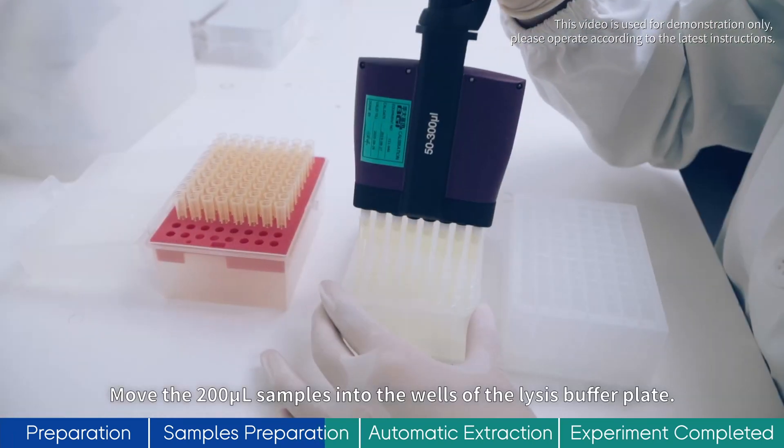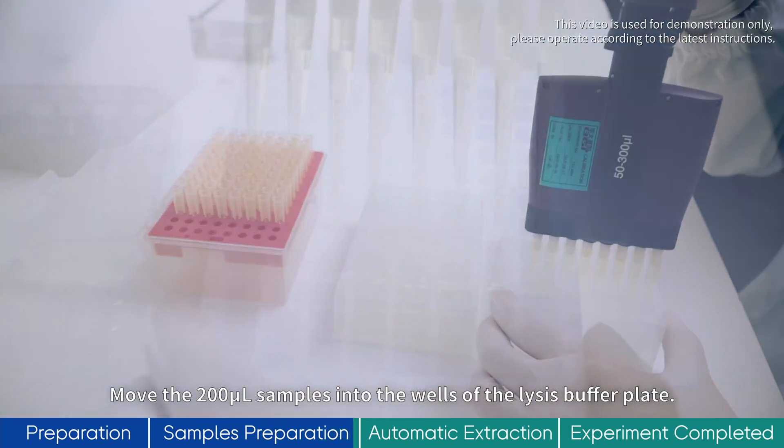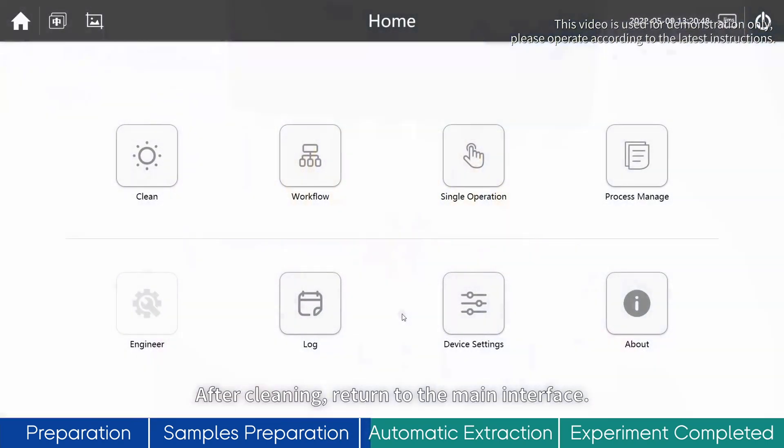Move the 200μL samples into the wells of the lysis buffer plate. After cleaning, return to the main interface.